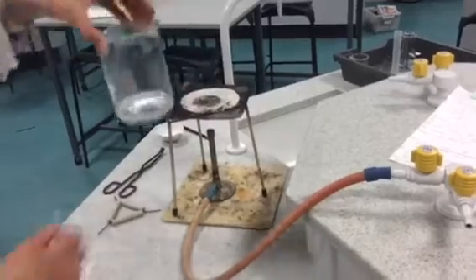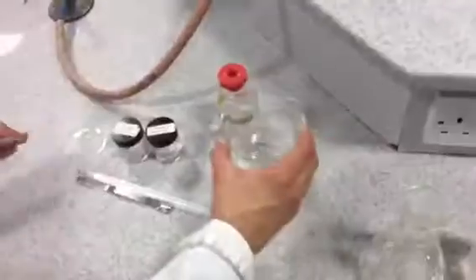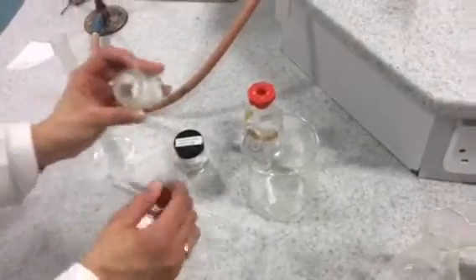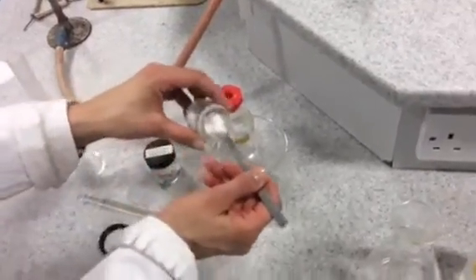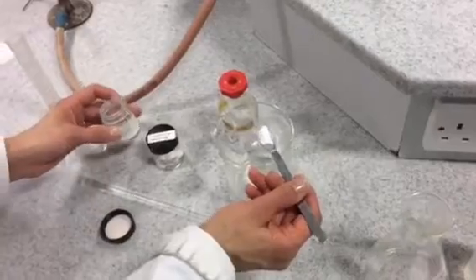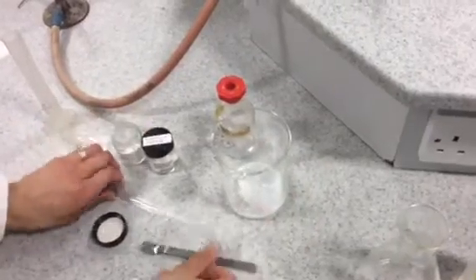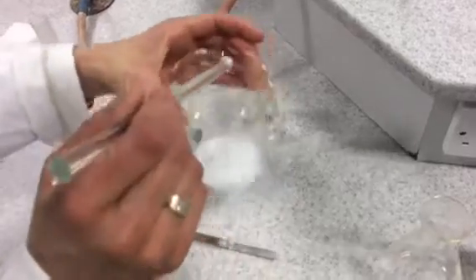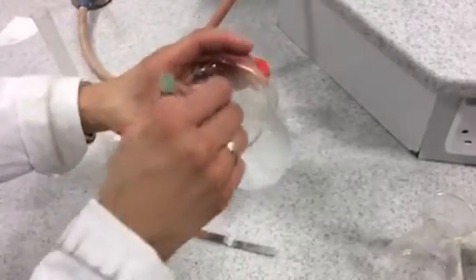Once you've heated up the acid, you're going to add your base — magnesium carbonate — to neutralize the acid. Start off by placing one spatula of magnesium carbonate into the acid and you'll see that it dissolves and reacts straight away.